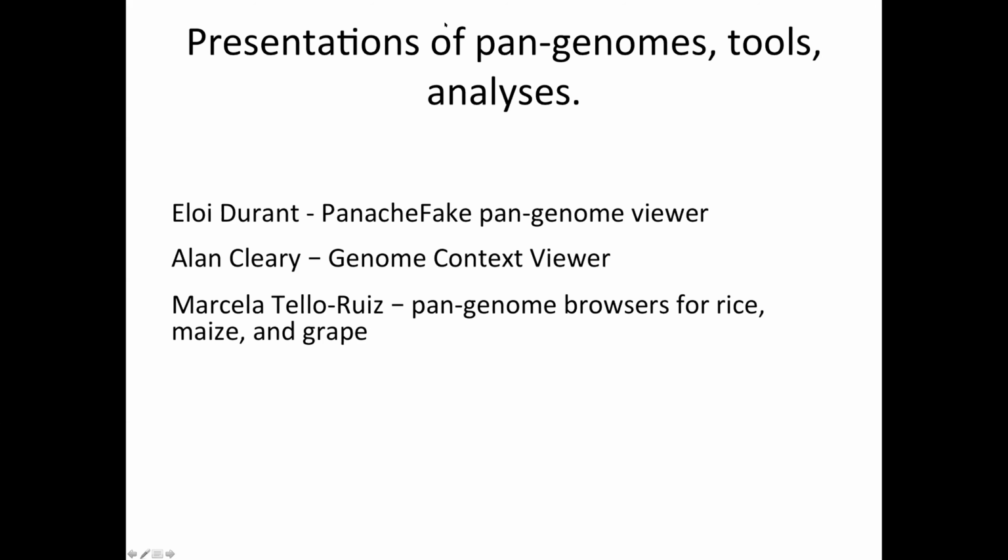Yeah, we run into that as well with, say, a species like alfalfa, which is an obligate outcrossing autotetraploid, and your assembly represents 3 to 4 haplotypes, and if you pick one, you might be picking a haplotype that happens to be missing a gene.